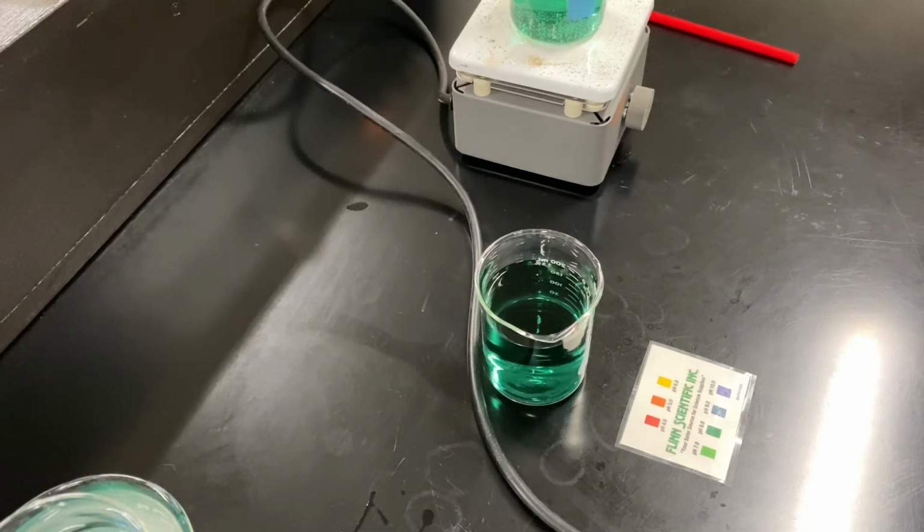All right, guys, we are going to do the Alka-Seltzer Lab. This is going to look at both solid solubility and gas solubility. So we're starting with a temperature treatment. We have water in 3 different temperatures. We have a hot water, we have a room temperature water, and then we have an ice water.